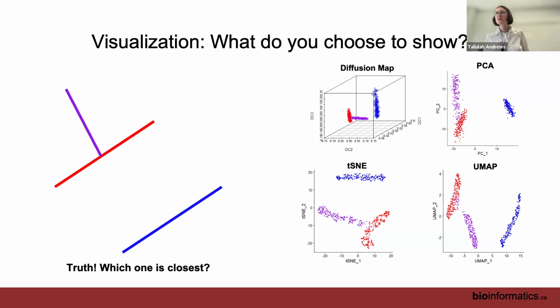We've got a question from Ottawa: how did you determine what the data actually looks like? I created this data. I created these patterns in two-dimensional space and then projected them into 20-dimensional space, and then calculated the PCA, diffusion map and t-SNE on them. So I know exactly what they originally looked like.